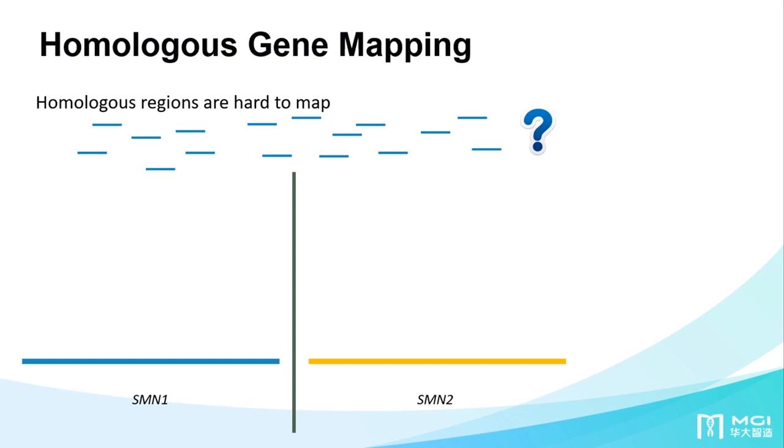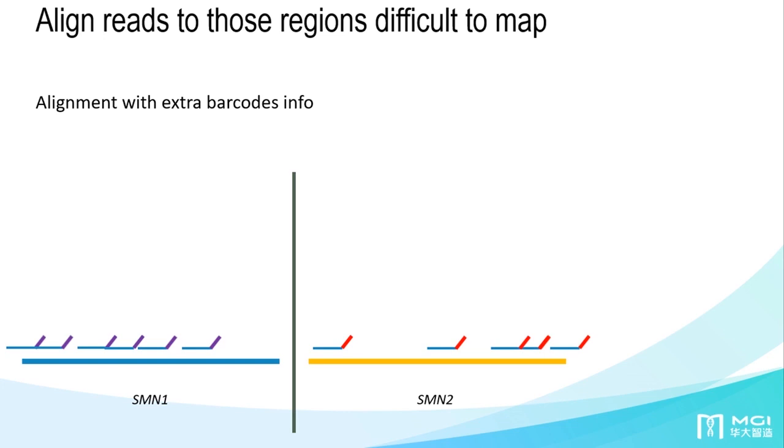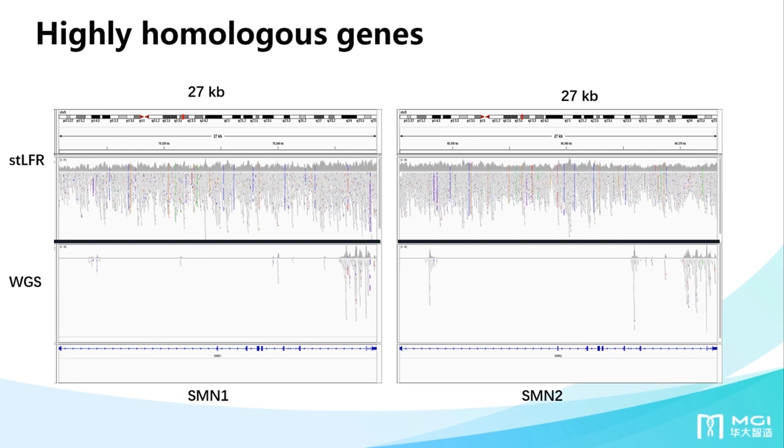And another application is for the mapping of homologous regions. So for genes with a lot of homologous regions or pseudogenes, generally with traditional reads, it's very hard to do the mapping. You'll get a lot of multiple mapping or low mapping quality. However, now we have this barcode information, we know exactly which molecule of DNA from these two genes these reads came from. So here's some actual data, this is IGV showing the mapping.